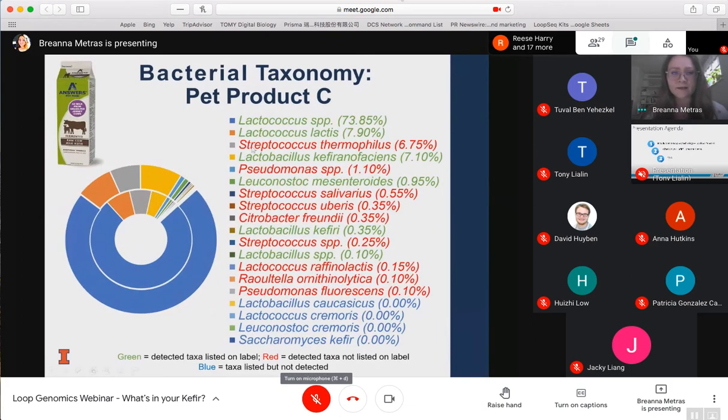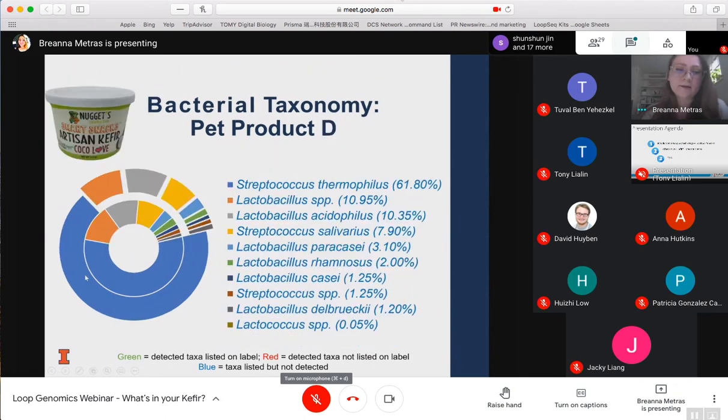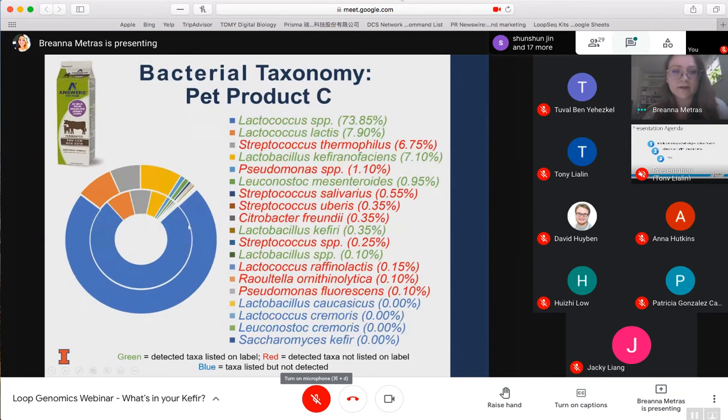Product C was Answers. Again, we have Lactococcus, and based on our new update, the most predominant species there was Lactococcus lactis cremoris. And then we also have Lactococcus lactis, and again, many species that were not claimed but were detected. Just in case there's confusion, the outer circle in each of these pictures represents one lot, and the inner circle represents the second lot. So this is just an image of both, but these final numbers are averages from the two.